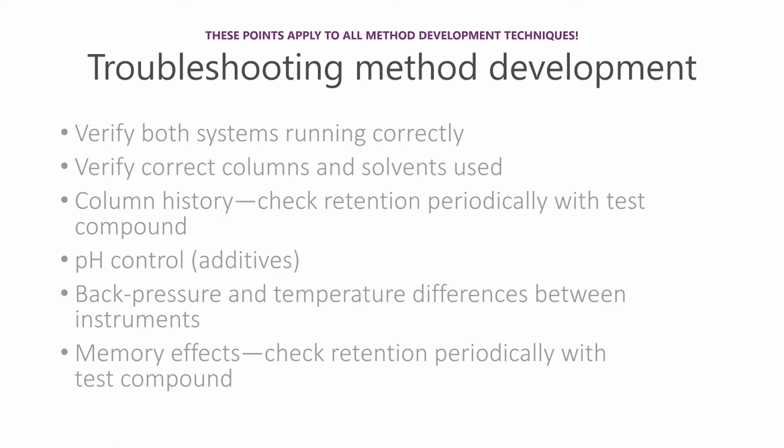Our Teledyne ISCO weblog describes using a checklist where we verify that we chose the correct column, solvent, additive, and even sample before starting a run. Sometimes columns wear out due to loss of bonded phase or irreversible adsorption of impurities.